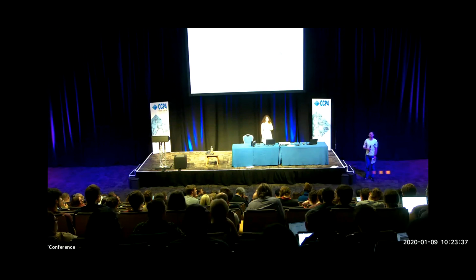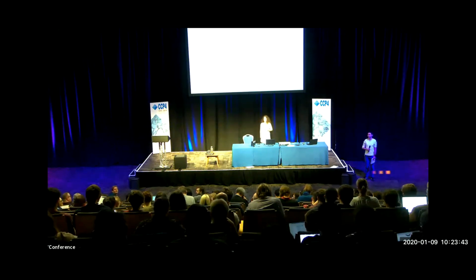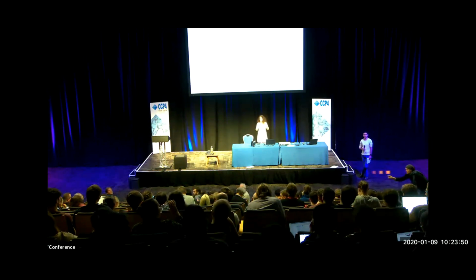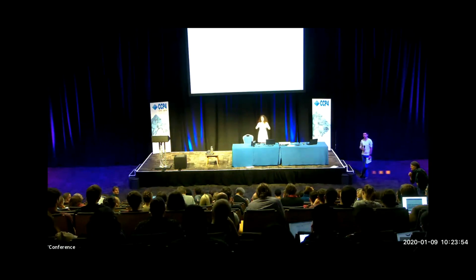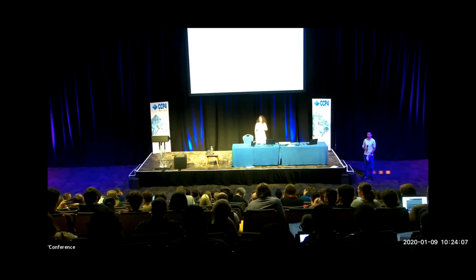Yeah, thank you, Helen. It was a really great talk. I have one question. You mentioned an anchor atom. How would you choose this anchor atom? Right, so the actual identity of the anchor atom doesn't matter too much because I don't have any dependence. The flexibility isn't dependent on where the atom is, and the positions aren't strongly affected either. But I generally choose the nitrogen closest to the center of the protein. Center of mass.